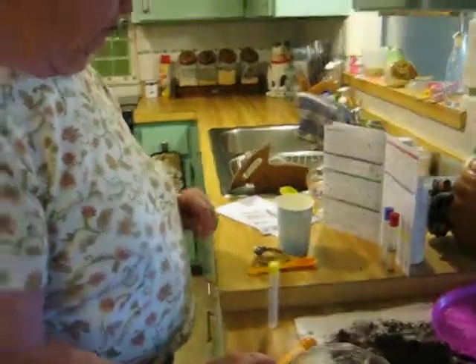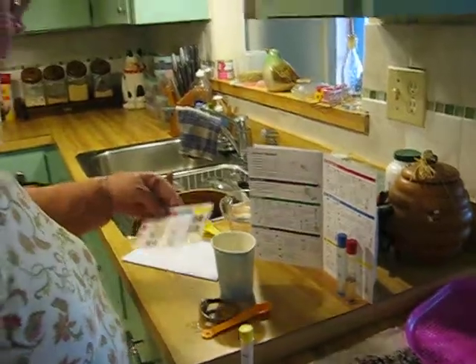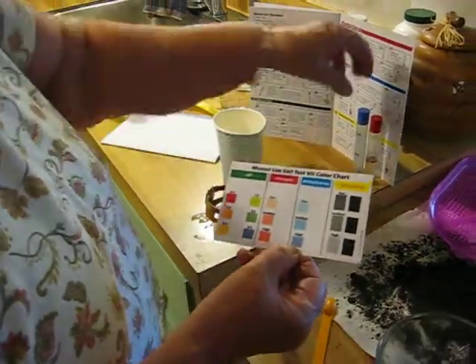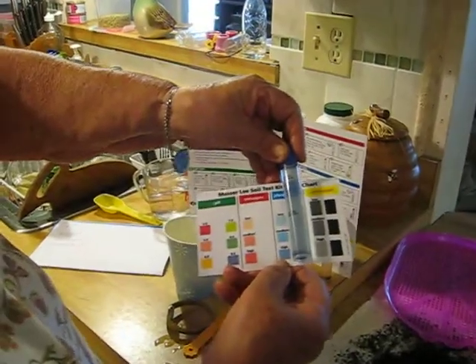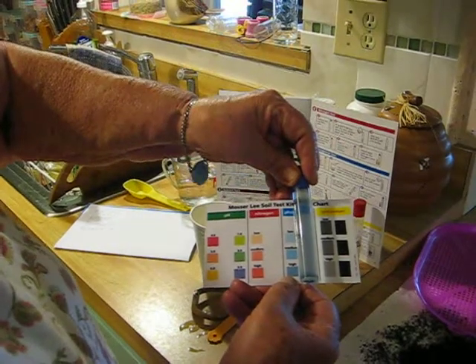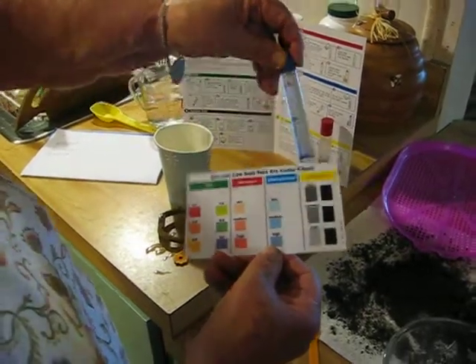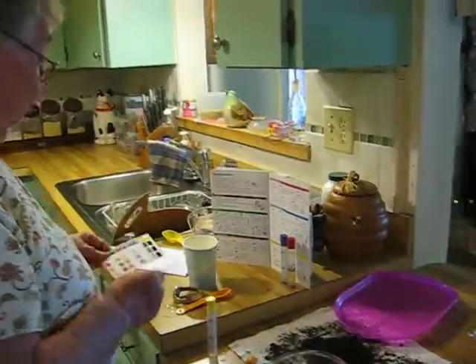We're going to check the phosphorus. We have three colors here for low, medium, and high. When I hold my sample up, you can see that it's low — it's not high. And so that's another thing that we need to probably amend our soil with.